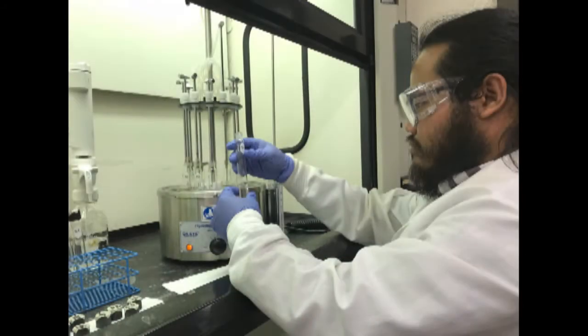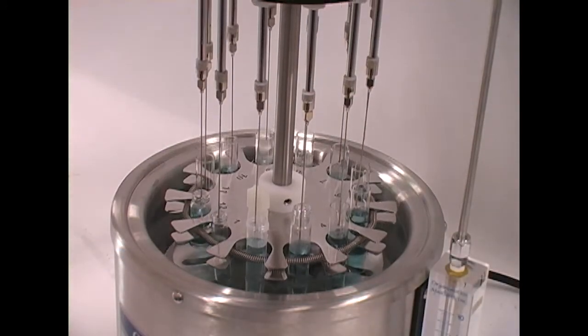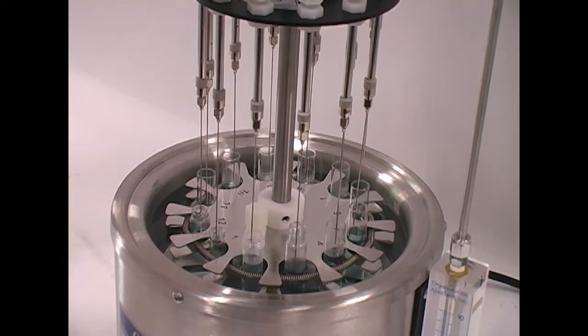This equipment is designed for use in the analytical or environmental laboratory by trained laboratory personnel for evaporative applications. Use of this equipment beyond its stated intended purpose and operating parameters is not recommended and will be the sole responsibility of the user.